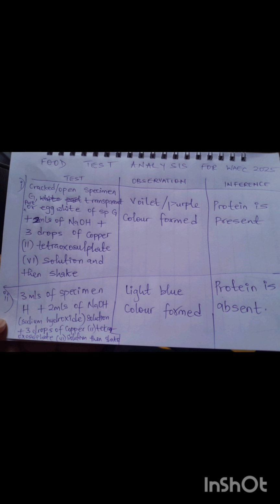It will not be purple because it's water you're using. You're not using egg whites. There's no protein in water. Then under inference, that's your conclusion. You write protein is absent. Please do not write protein is present. You fail it.